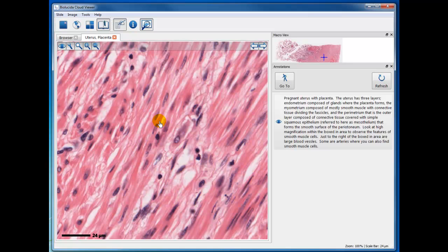They're not tapered, they're cylindrical, and skeletal muscle cells are not tapered, they're cylindrical. So on a longitudinal section, a smooth muscle cell is tapered at either end, and a skeletal muscle cell is like a rectangle on section, and so is a cardiac muscle cell, except cardiac muscle cells are not pure rectangles because they have branching. Adjacent cells are connected together by branches.